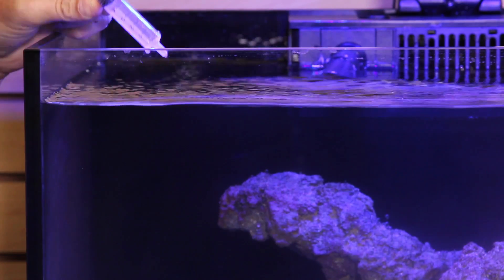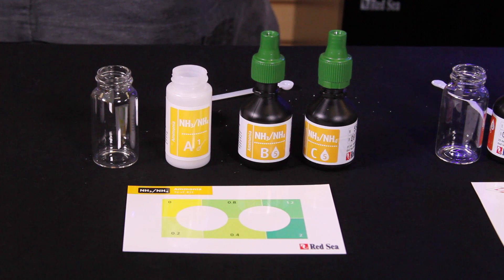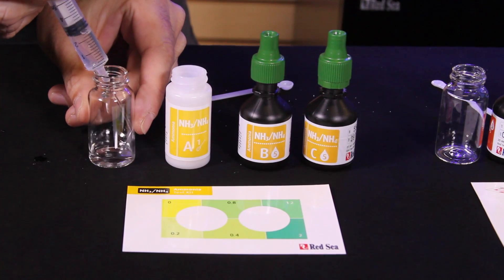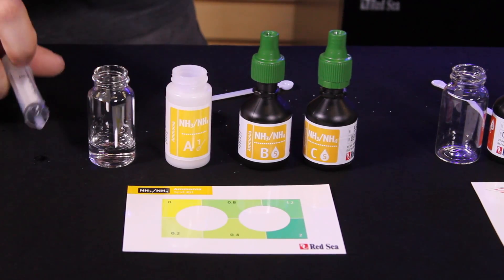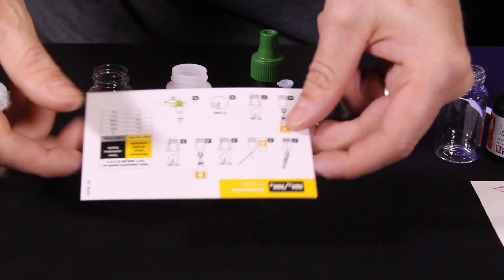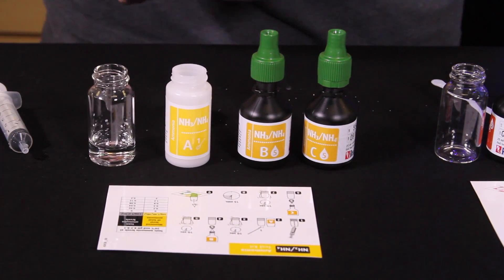All right, I'm going to start by drawing five milliliters of sample water from our aquarium. I'm going to put that into our test vial. Now each of the test kits comes with a card with directions on one side and a color comparison chart on the other.